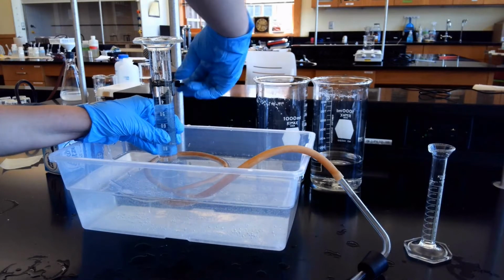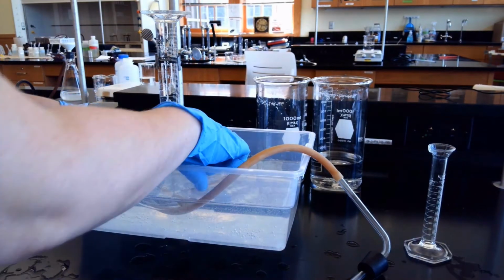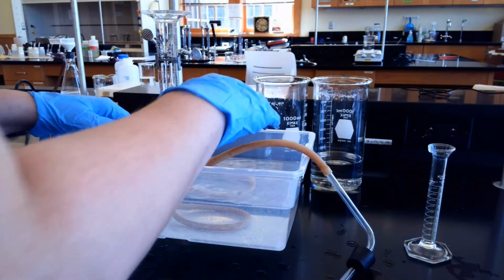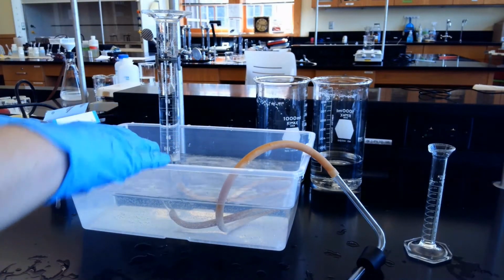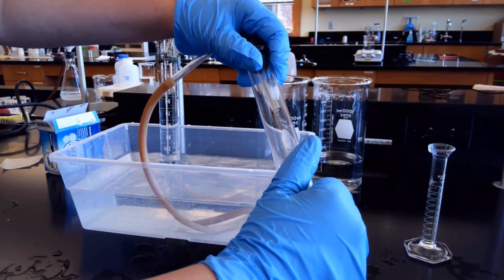Now, seeing no bubbles at the top, we're going to move this over and tighten it on, and then raise this up just a little bit so we can poke our other thing underneath. Same as before, we have our glass tube and we're going to put that in. So our glass is in. Now I'm going to try to dry off my gloves a little bit. We'll take our generator and attach the top. So now we're firmly connected.